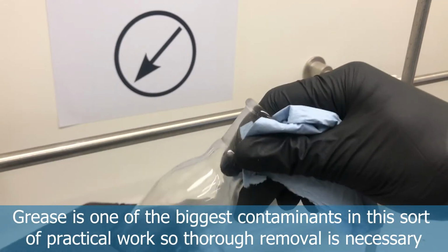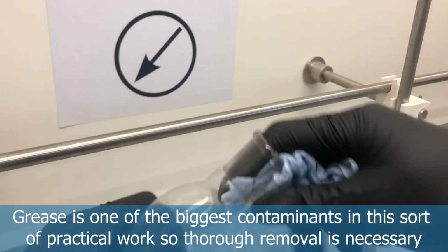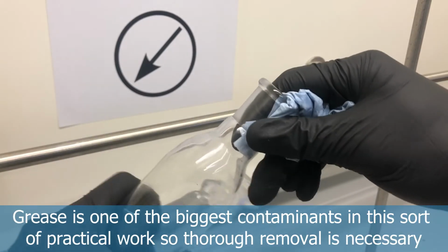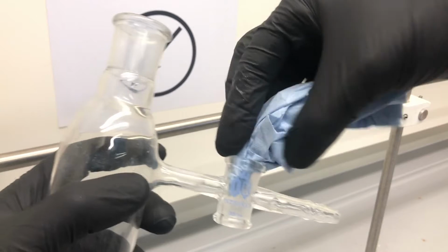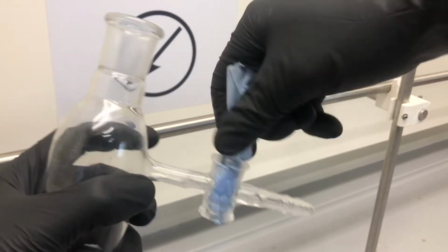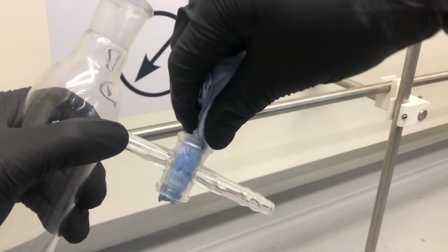So thoroughly removing it from the neck. And then we can undertake our subsequent cleaning processes with soapy water and acetone before it goes back into the oven. The arm of the Schlenk tends to be the hardest to reach place, so it's getting some blue roll in there to remove the grease from the joint, and then also using a pipe cleaner to really get into that narrow arm part.